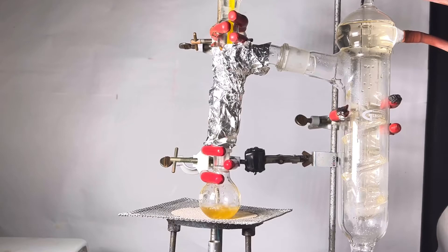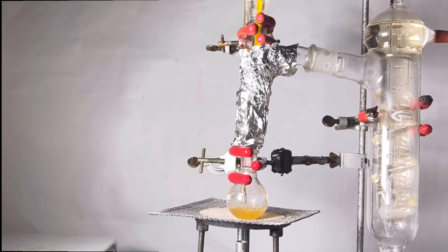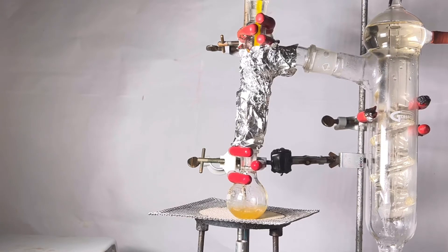When the temperature reads 184 degrees C, a liquid starts to boil and condense through the Friedrich condenser. That is the pure valeric acid.